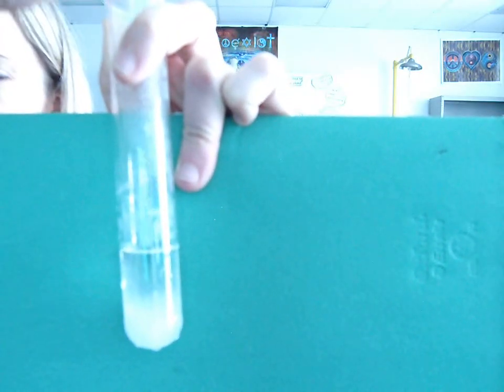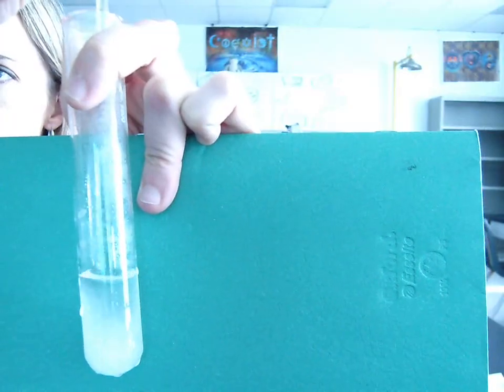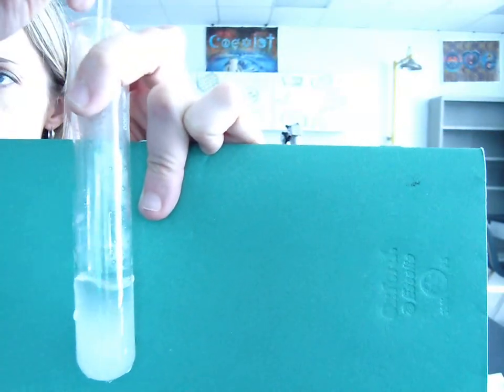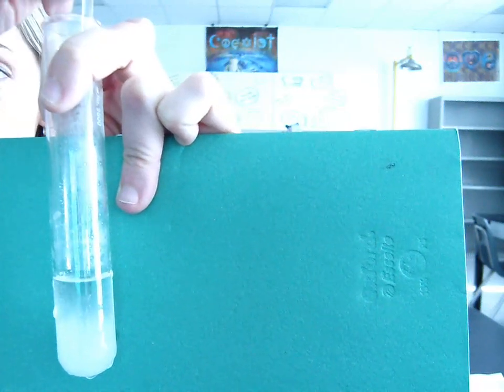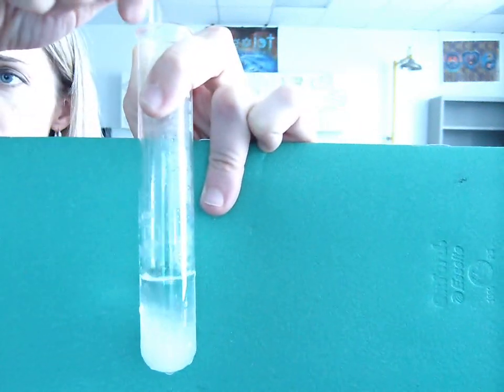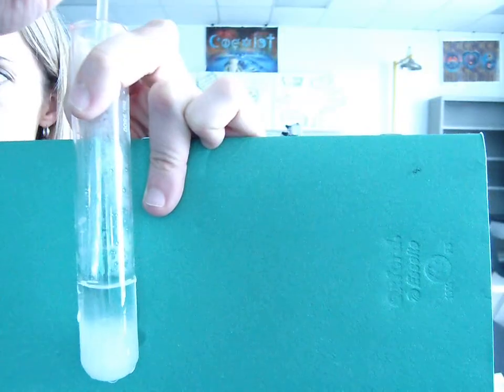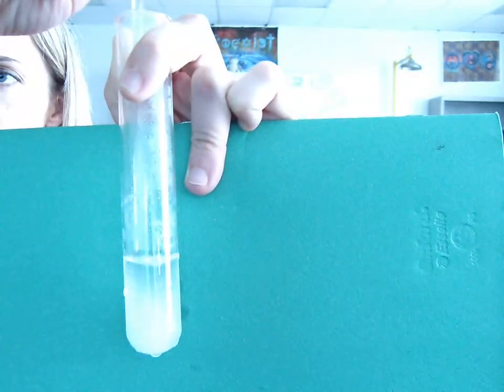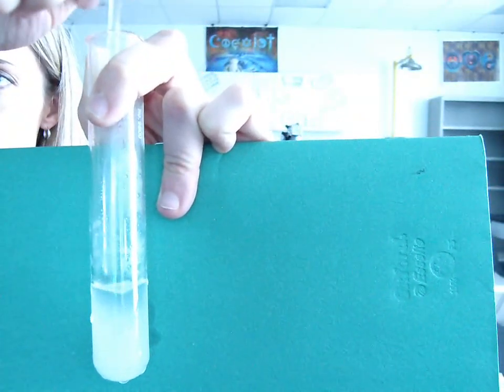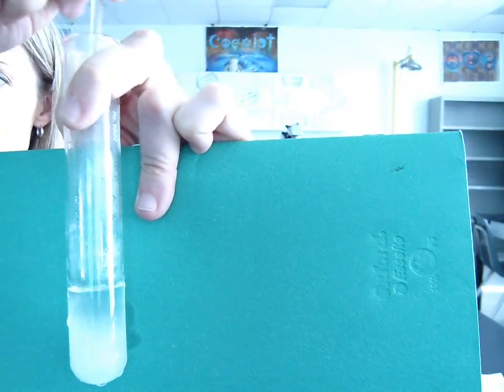So what's really interesting is that when we heated it, all that stuff totally dissolved. There was no solid in there at all. You just saw that. It was a totally clear liquid. As soon as we cool it back down again and decrease the temperature, this substance comes right back out of the solution again. We call this a precipitate. When a solid comes out of a saturated solution, we call that a precipitate.